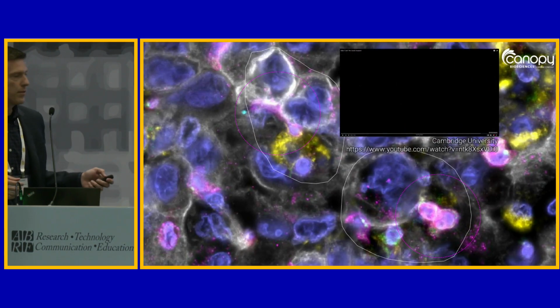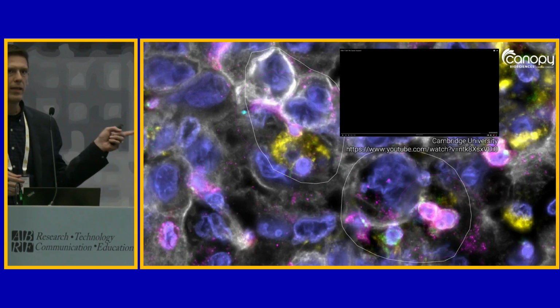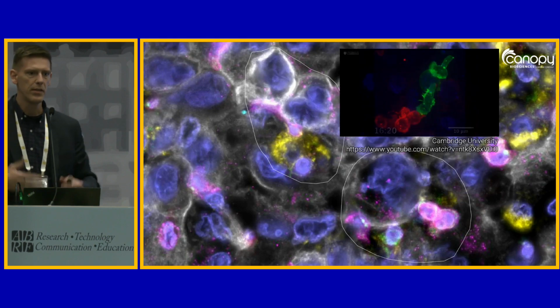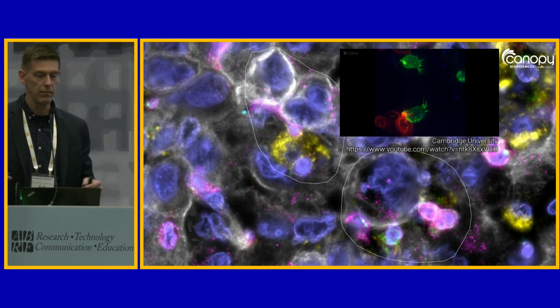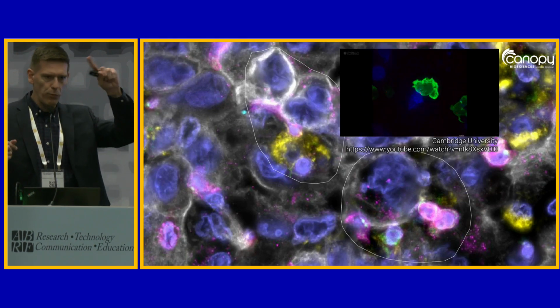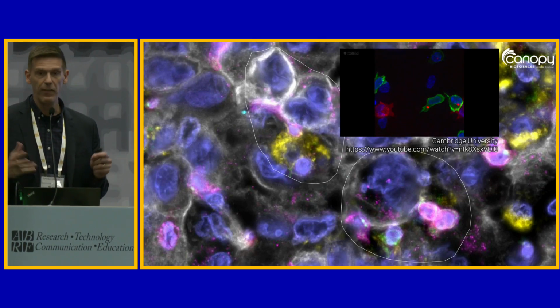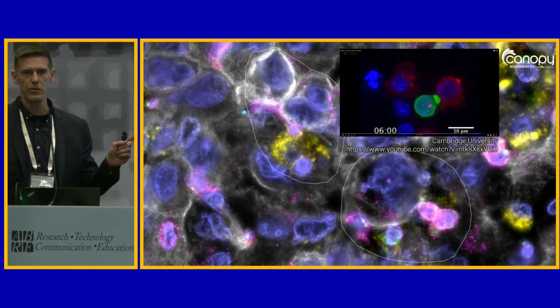We take a look at another example really quick here. So these are T cells attacking cancer again. On the left, you see a T cell that's actually wrapped around those cancer cells. T cells, if they're happy, if they're active, are incredibly active. So they're swimming around the cancer cells and they're attacking them over and over again. These are live cell favorites because this kind of dance of death is just so pretty.